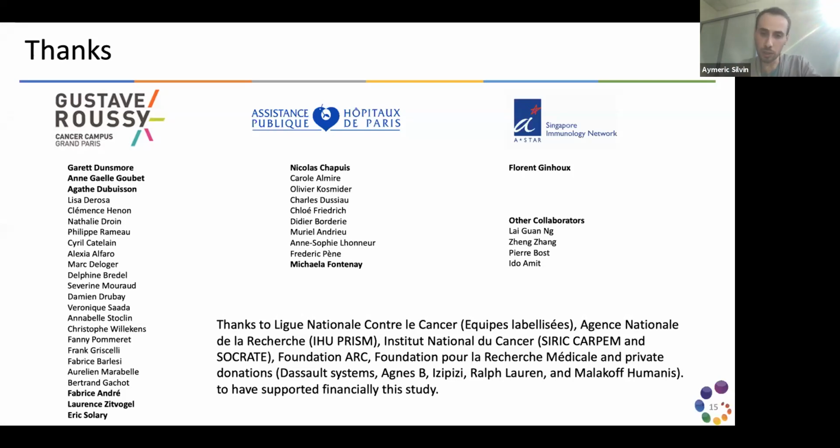So very strong proteins, but really, Cytek has amazing people who help if you have a panel and you want to optimize it. You can send your panel that you try to build. They also have a beautiful app, a website, which is called Spectrum. You can go there, choose your fluorophore, then create your similarity matrix, and then you just have to look at the numbers.